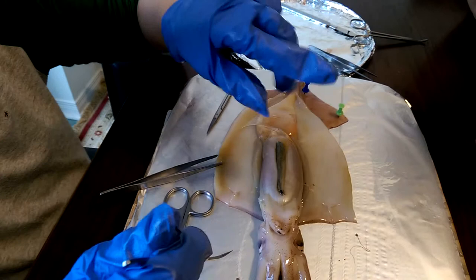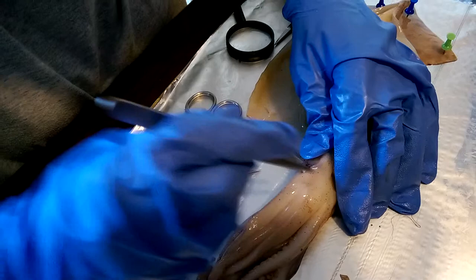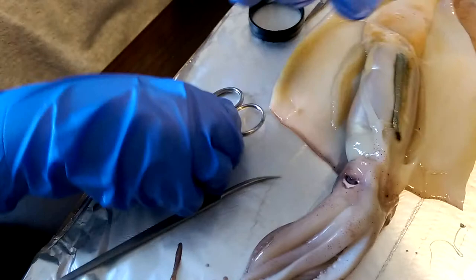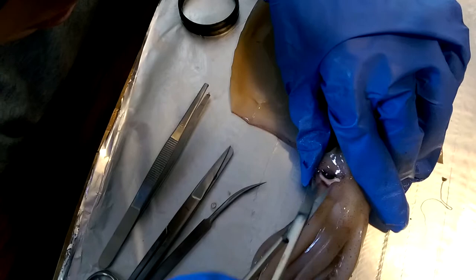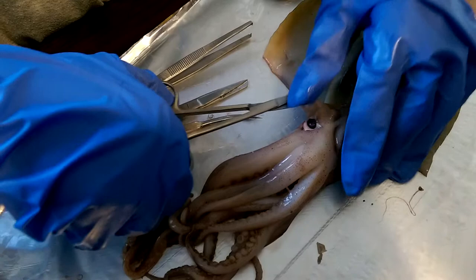Now I'm going to try to remove the eye. I've got to just turn it a little bit. The eye is just right there. I have a plan — these tiny scissors, you see the tiny blades. I'm going to try to cut there, then my next place, there, and then another cut. See?